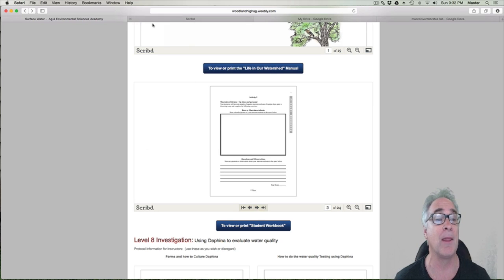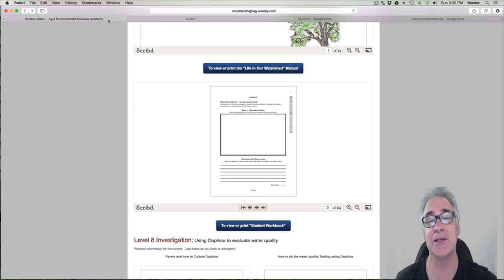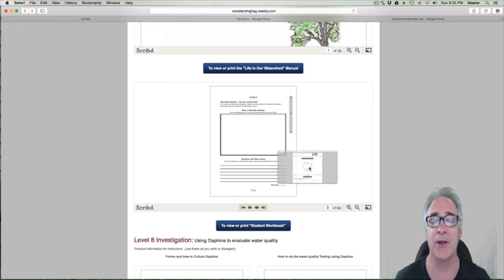To do that, as you can see, we've got tabs here. Hope you're in either Firefox or Chrome, or on a Chromebook. Don't use Internet Explorer, please. This doesn't work very well on that. I've told you that about a million times so far, so please don't use Internet Explorer. It's going to lock up on you. Anyway, you're going to click on the tab and bring it into the center page. And look, it's already separated.